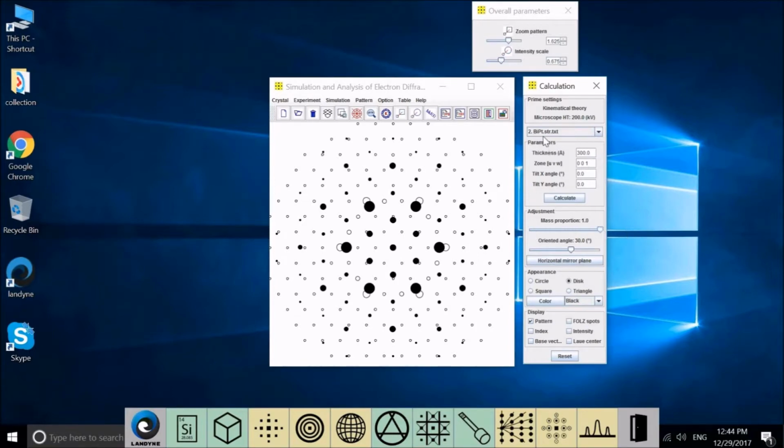Originally, this bismuth platinum phase has a proportion of 1 and will be like this, but experimentally we observed that this pattern's intensity is rather weak. This will be the second phase, so I had to drop the mass proportion to get it small. This looks like a fit to the experimental patterns.